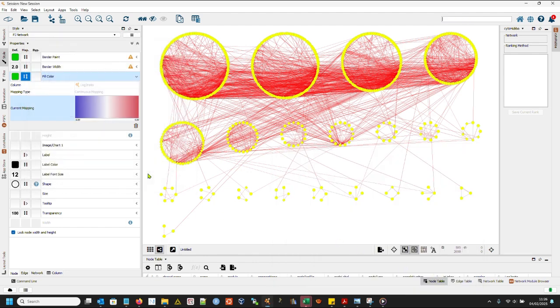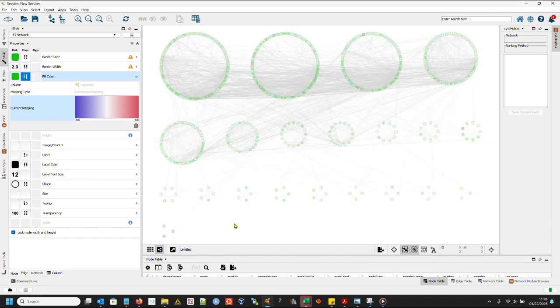And now if I go back to network, I can see that the colors of the nodes have been changed. In greens are the linkers, and blue to reds are the genes that are part of our network. And we can see that some nodes have got more intense colors than others because their differential expression is higher.